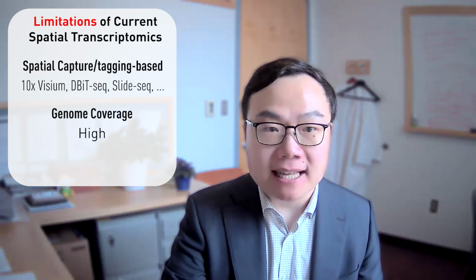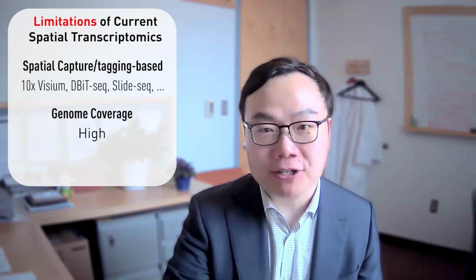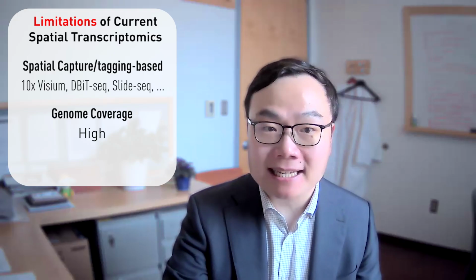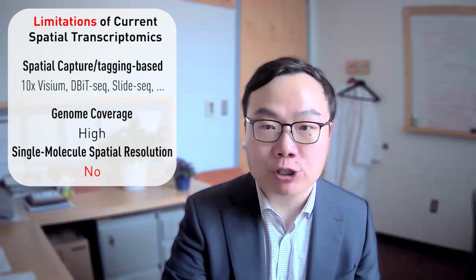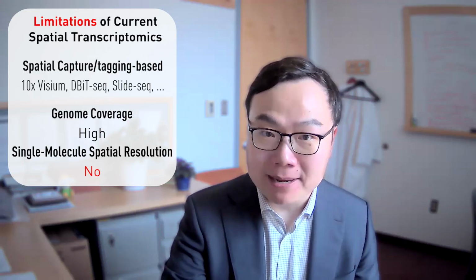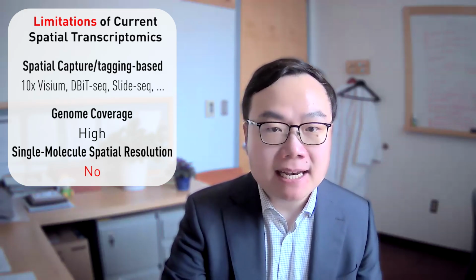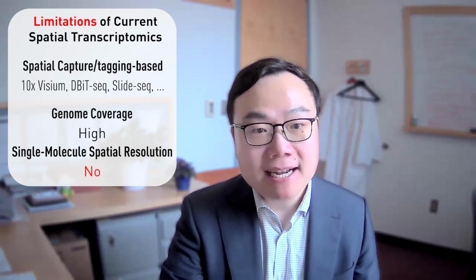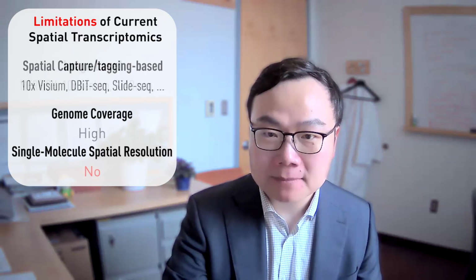The advantage here is a high genome coverage, and in principle, all poly-A transcript species have a chance to be tagged and sequenced. However, these techniques have limited spatial resolution, which is defined by the size of the 2D array element. They don't have single molecule spatial resolution, and oftentimes the single cell segmentation in space is also ambiguous, leading to challenges in fine-scale spatial analysis.